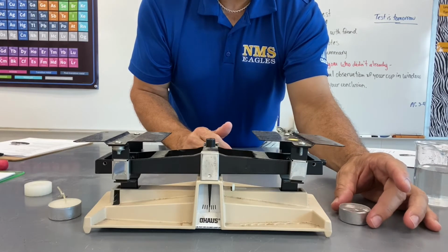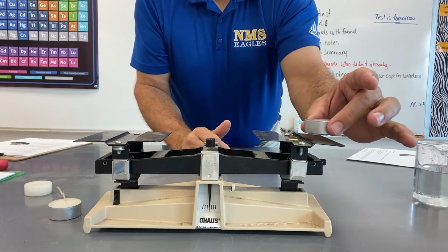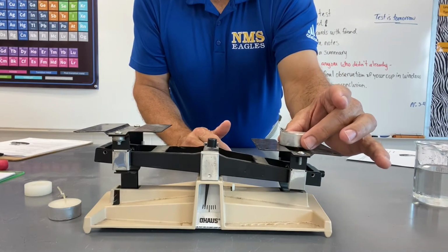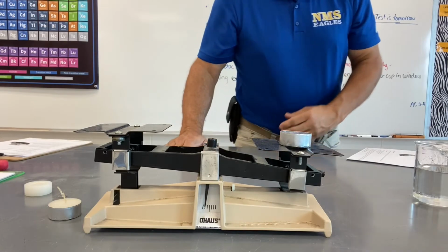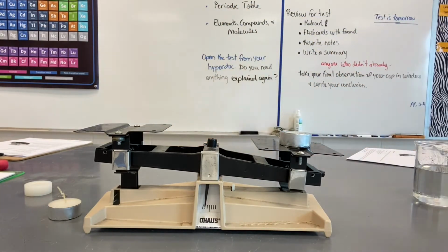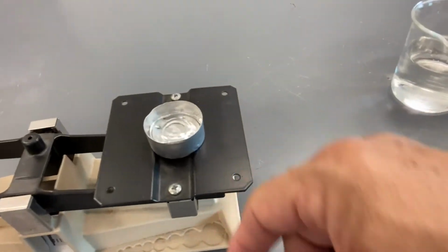All righty. It is full, and it is squishy. All right, let me bring the camera up over the top just so you can see it's full, and I am not fooling with you. And bump this a little bit so you can see the water move.